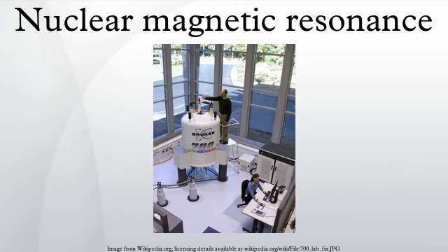Electron spin resonance is a related technique in which transitions between electronic spin levels are detected rather than nuclear ones. The basic principles are similar, but the instrumentation, data analysis, and detailed theory are significantly different. Moreover, there is a much smaller number of molecules and materials with unpaired electron spins that exhibit ESR absorption than those that have NMR absorption spectra. ESR has much higher sensitivity than NMR does.